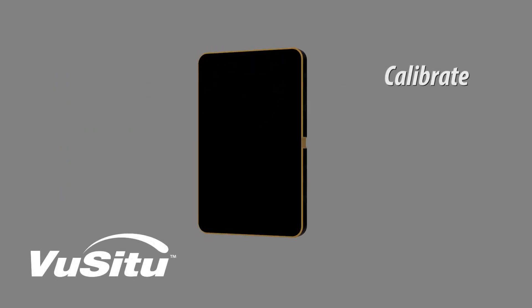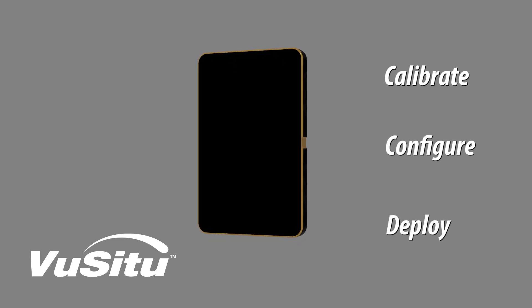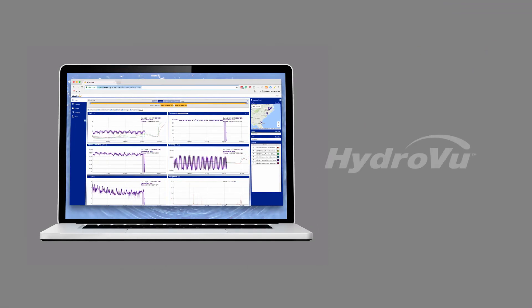With the VuSitu mobile app, you can configure and deploy the Aqua TROLL 500 with your mobile device. View your data with HydroVu, In-Situ's data visualization software.